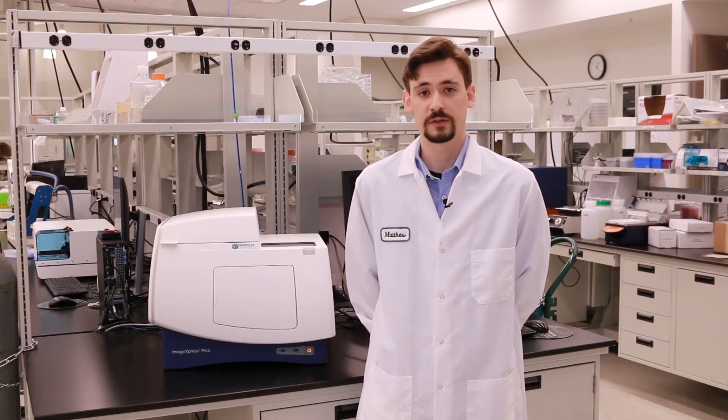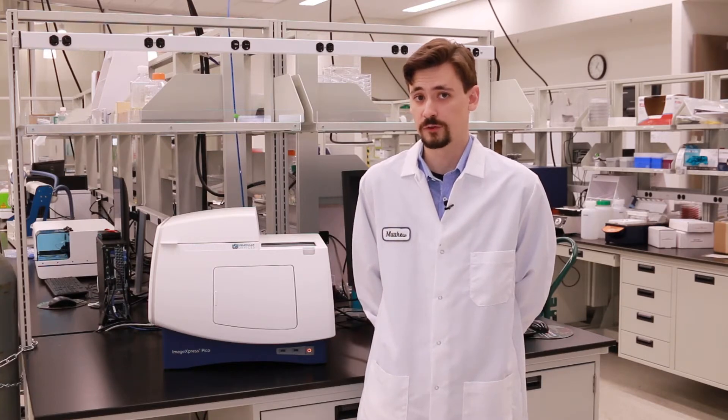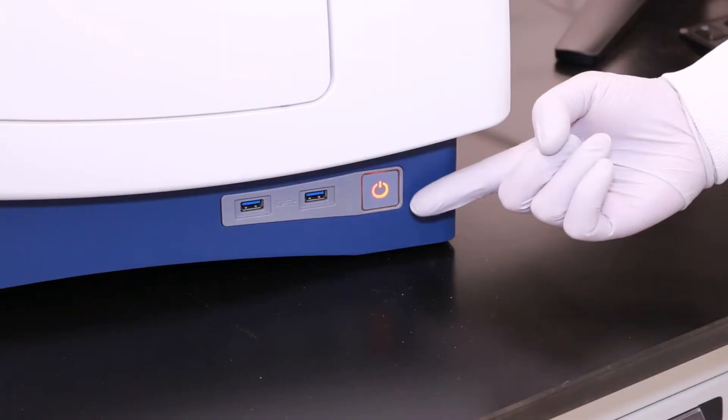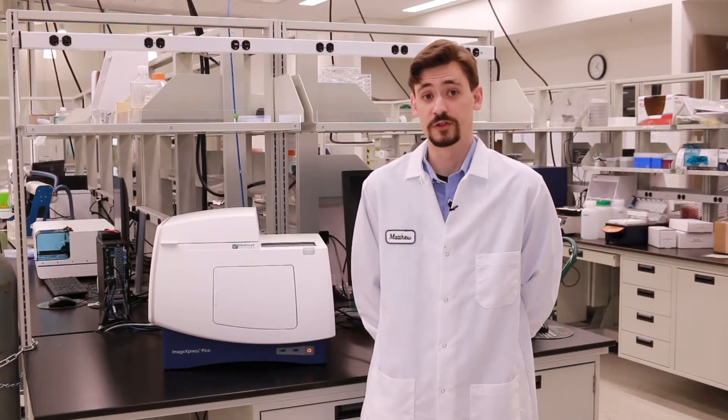Before we get started on the installation process, I do want to mention that it is important to have your instrument off, which you can tell by the power button down here at the bottom of the instrument. If it is amber, then you know it is off. Now we can turn our attention towards the back of the instrument, where we will be installing the environmental control components.